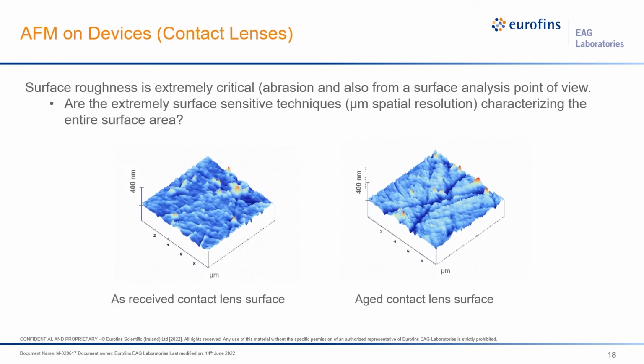Atomic force microscopy, more commonly called AFM, is a very useful technique to understand the surface roughness of materials. Classical surface analysis techniques measure the top 5 to 8 nanometers of a surface, and the materials in the crevices and ridges are not easily detected. It is essential to characterize the surface morphology to be sure that we are analyzing what is there.